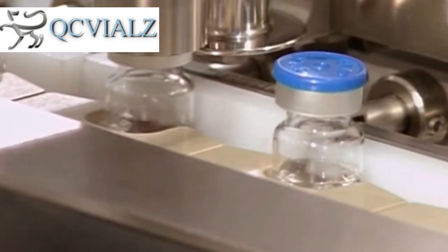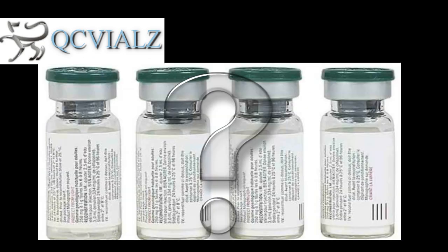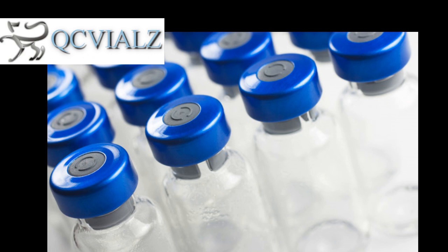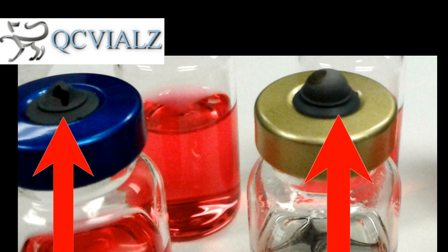If the seal used in the vial packaging process is a typical Sanitaire or flip cap style seal, vial stopper integrity may not be immediately apparent. If your vial packaging uses a pre-hole punch style seal, you can immediately tell if the vial stopper failed the autoclave cycle by the appearance of a blister through the seal opening or as a complete rupture.